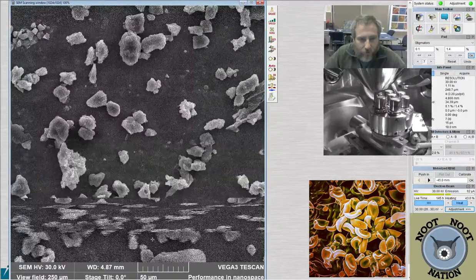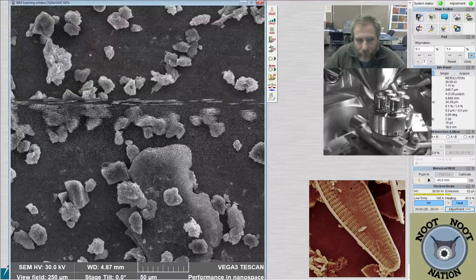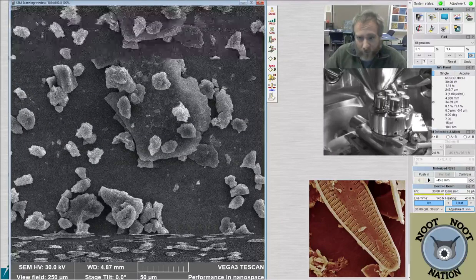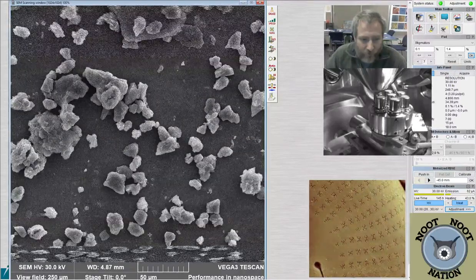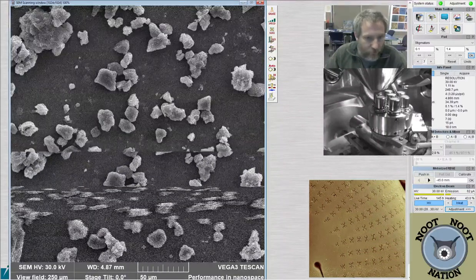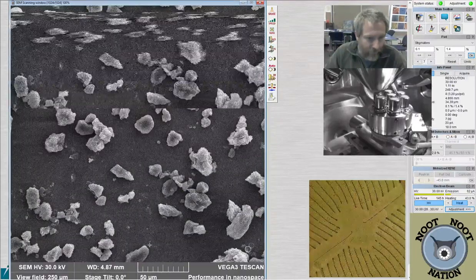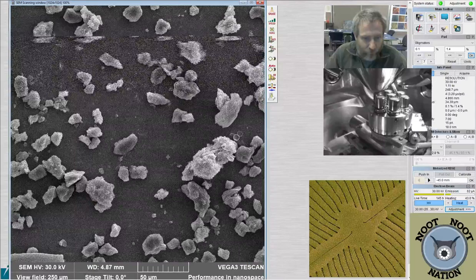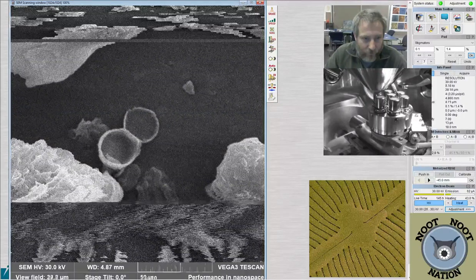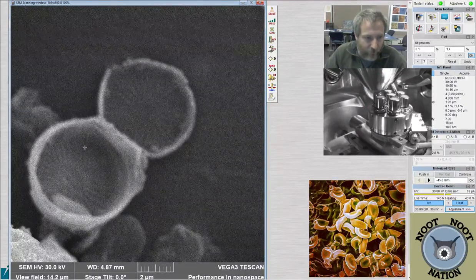So all of the images that we've been collecting so far have just been from one sample, which was collected from the sediment core. I have like seven of them in here, in the actual SEM in the carousel that you can see below. So we could always switch to another one, but I feel like there's a lot of debris on all the slides, or all the stubs. So, you know, this one has actually a fair number of diatoms on it. So let me just stick with it for a little while.